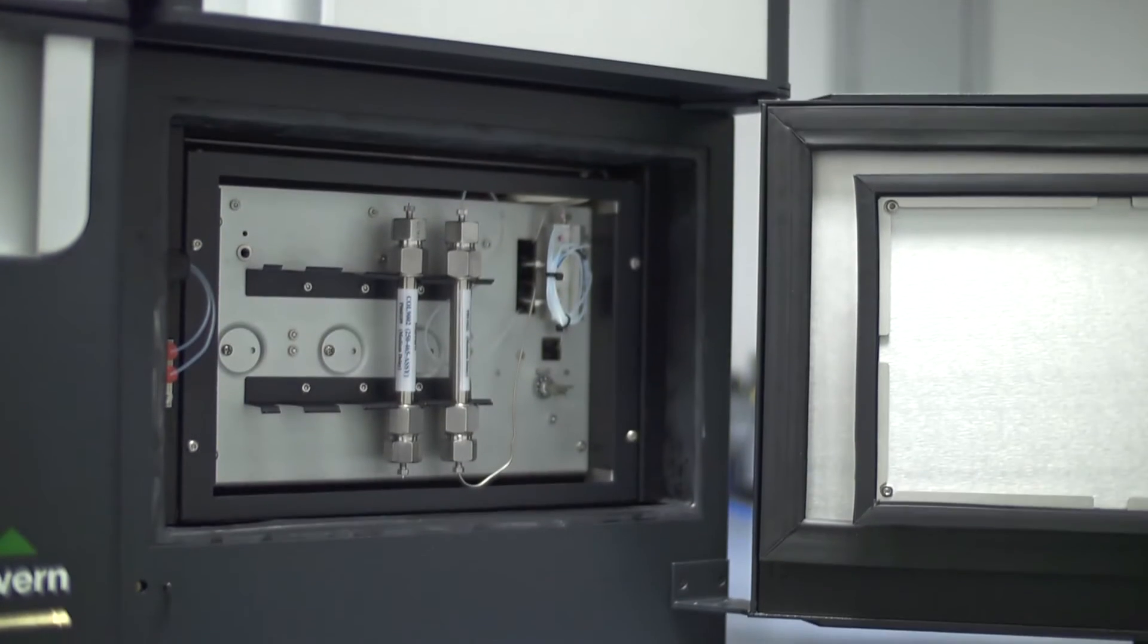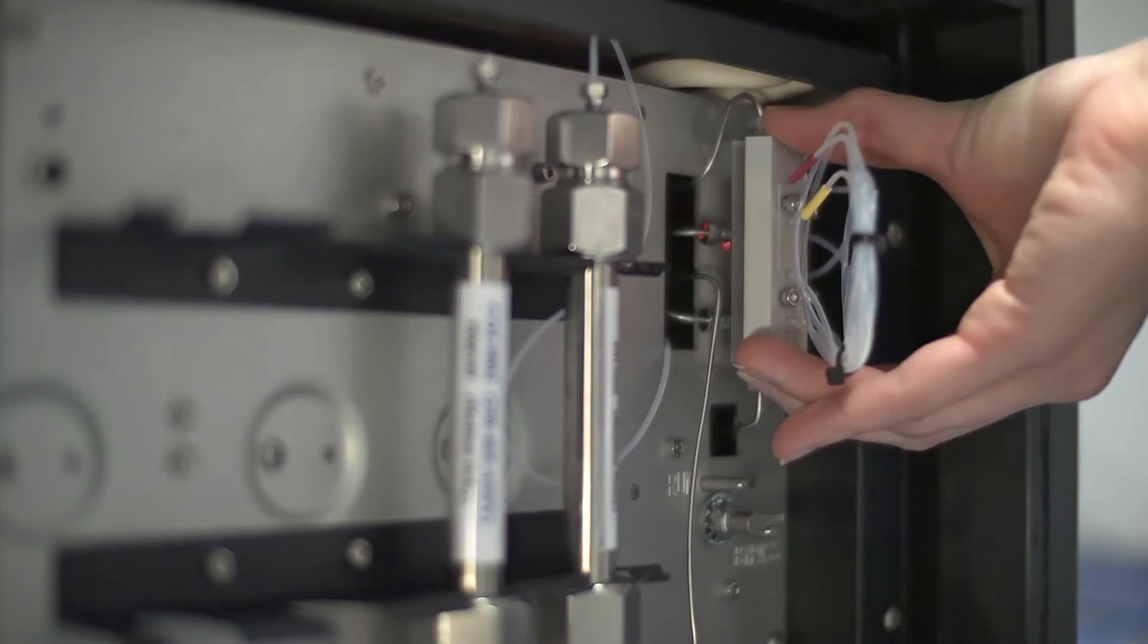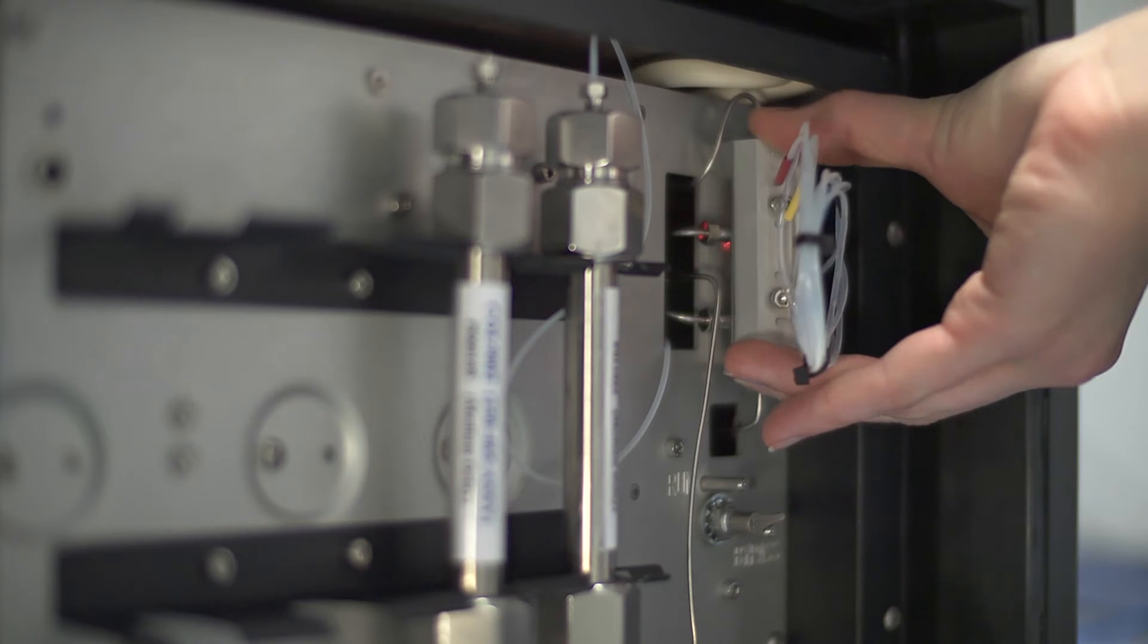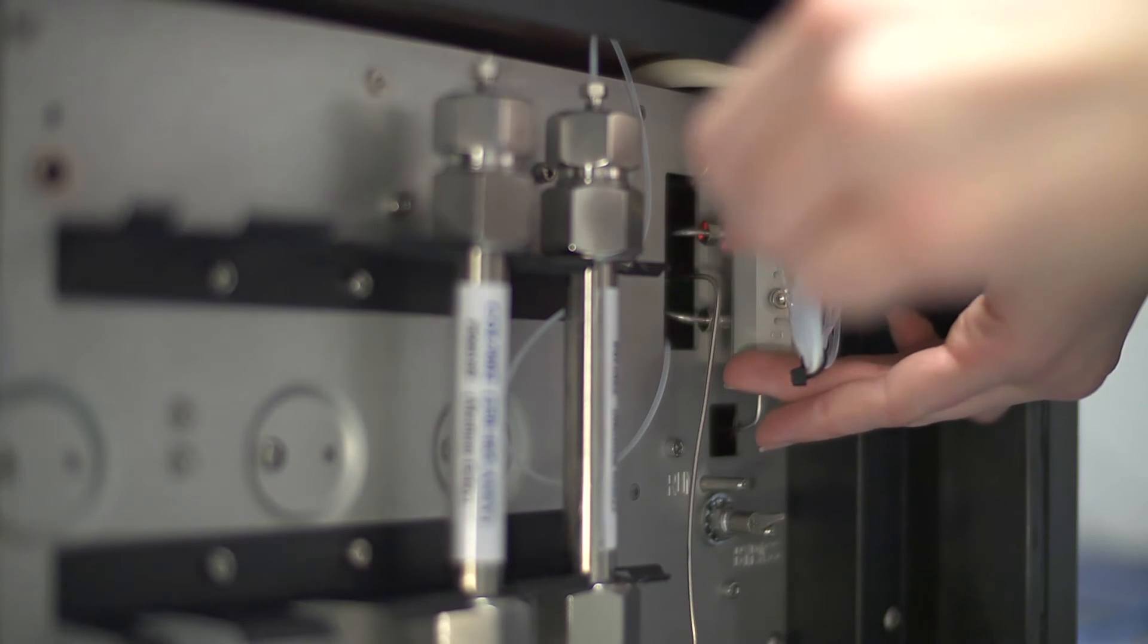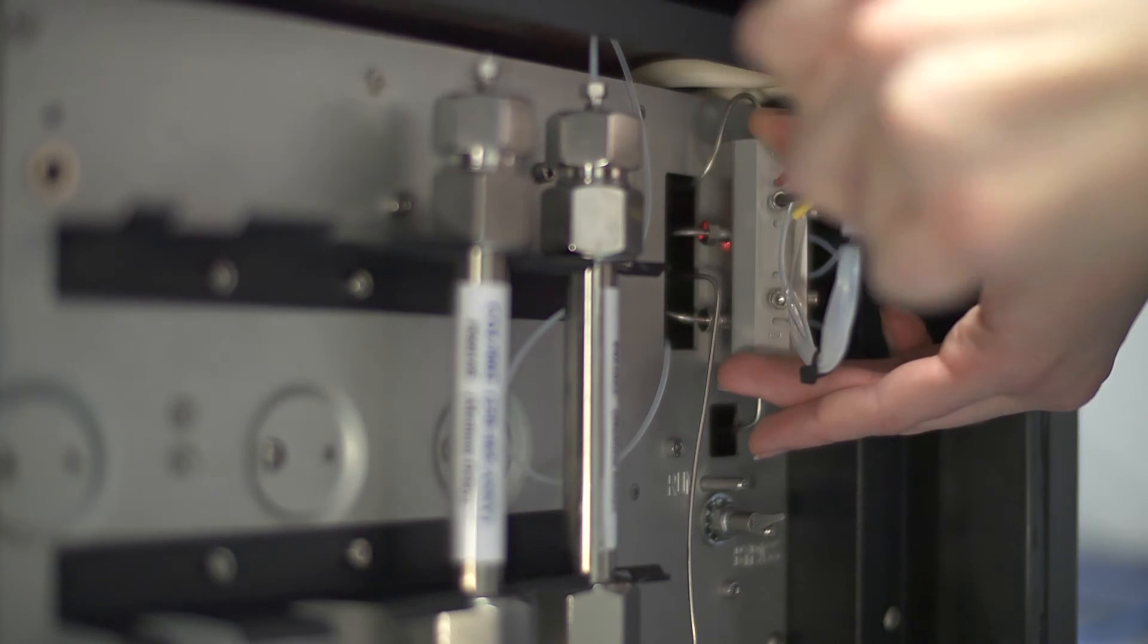With an RI detector that is first in series, inter-detector tubing is minimized to virtually eliminate band broadening and maintain resolution.